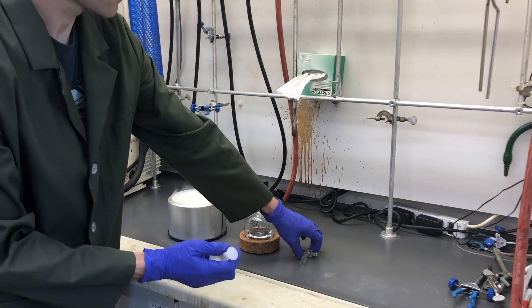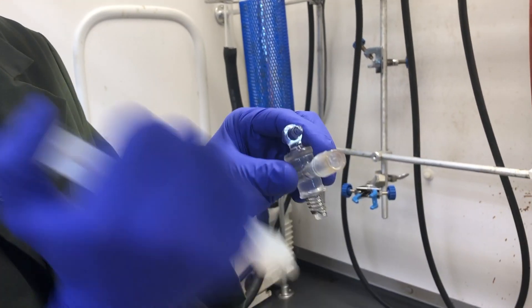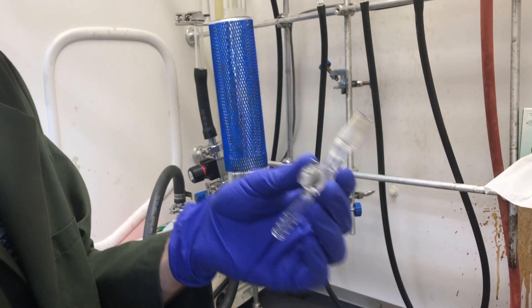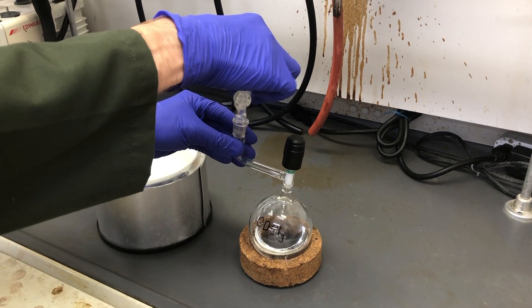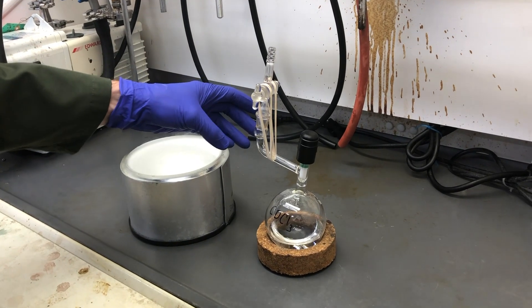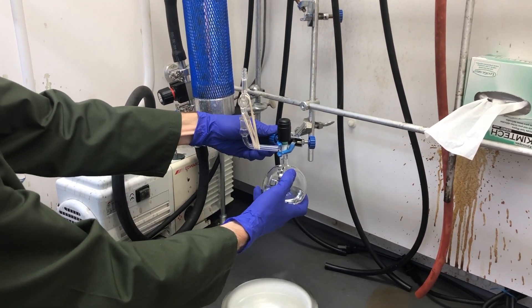Mitch is using a Teflon stopper storage flask for this procedure and he'll attach a hose adapter. Using silicone grease here is necessary for an airtight seal. Rubber bands are used to hold the pieces together, and the flask is then mounted on a clamp and attached to a rubber hose on the Schlenk manifold.